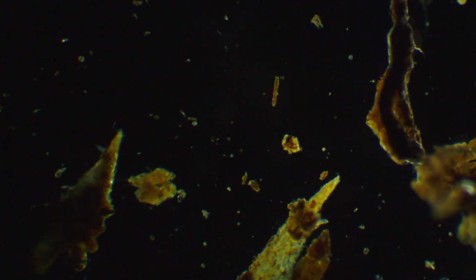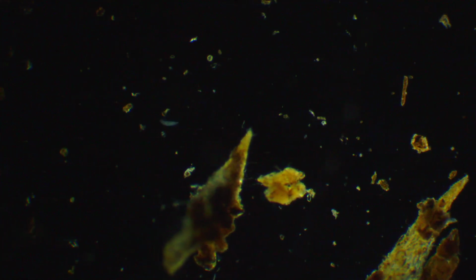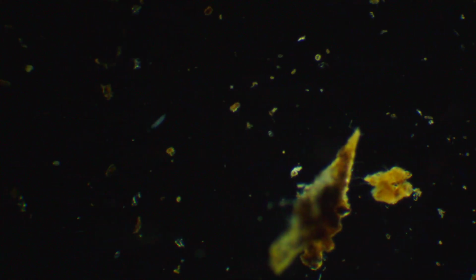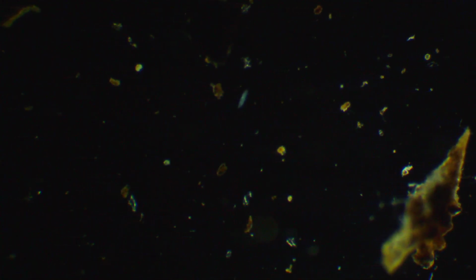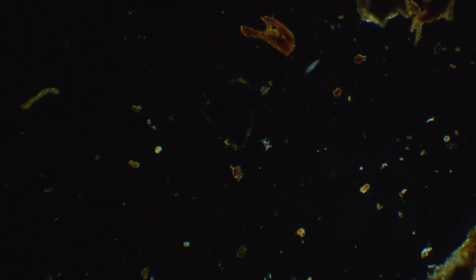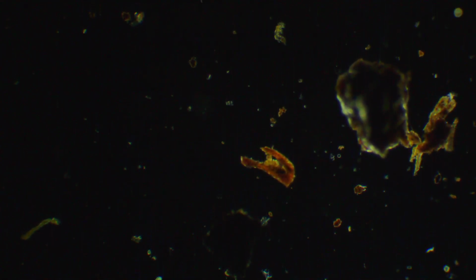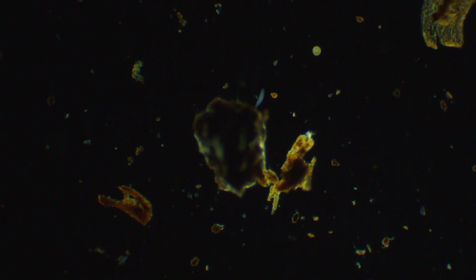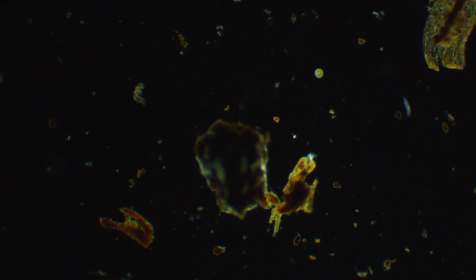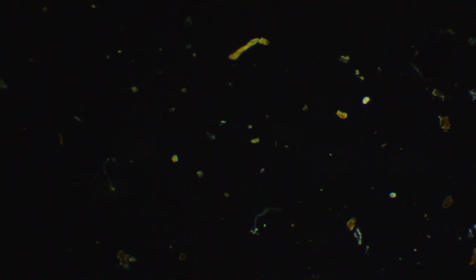Oh, look. What are you? Paramecium? Slender guy? Kind of flops around. Spins around and stuff. That little dance. Do a little dance. Everybody wants to see you dance. Yeah, that's pretty good moves. All right, moving right along. Let's see what else is over here.